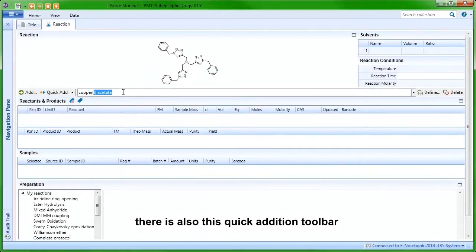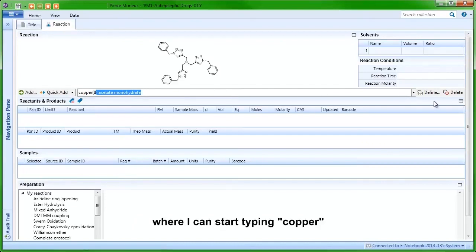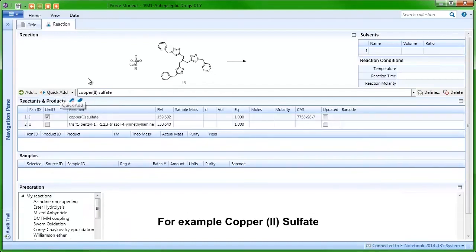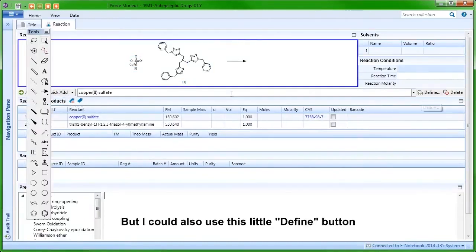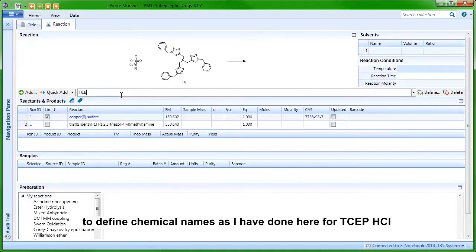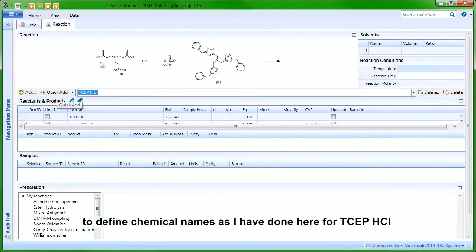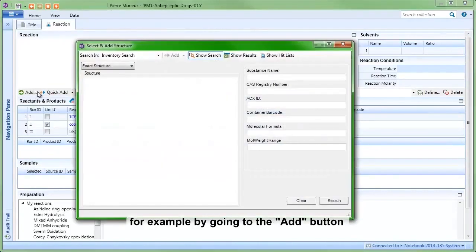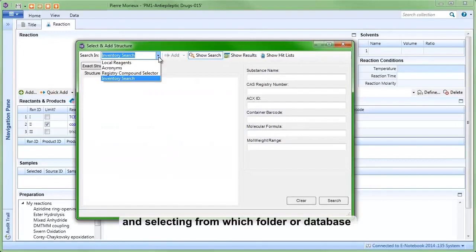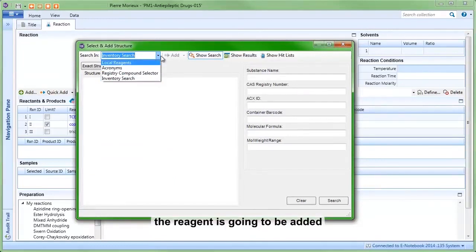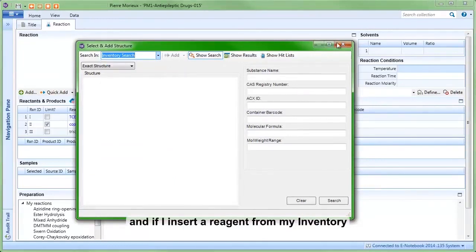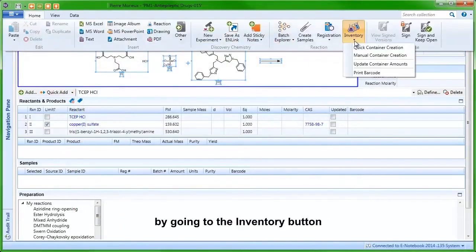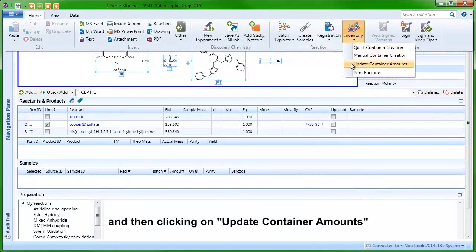There is also a quick addition toolbar where I can start typing 'copper' and then select from the list of different possibilities — for example, copper sulfate — and then click on Quick Add. I could also use the Define button to define chemical names, as I have done here for TCEP HCl. There are other ways to add reagents to a reaction, for example by going to the Add button and selecting from which folder or database the reagent is going to be added. If I insert a reagent from my inventory, I will be able to update its remaining amounts directly from the notebook by going to the Inventory button and clicking on Update Container Amounts.